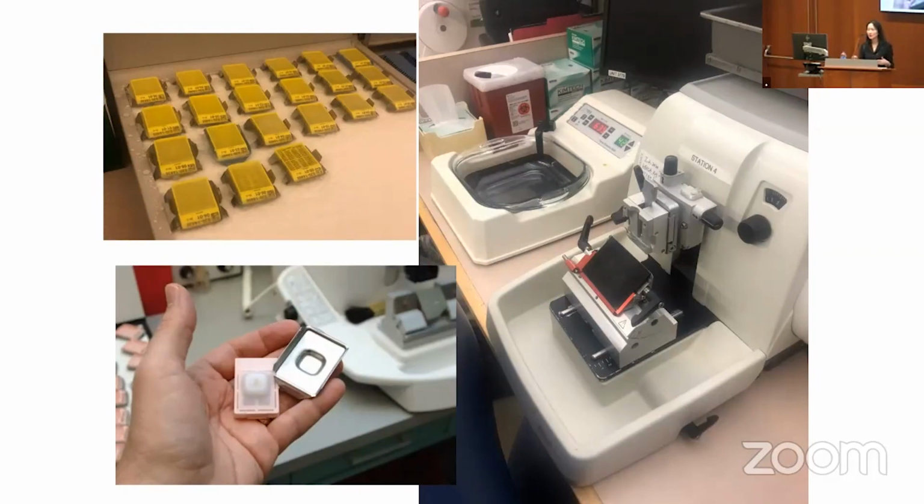The protocol that I have had them do so far at Yale is to do 2 H&Es that are flanking 5 unstained slides, and at the end, an extra slide for my reticulin stain. So all in all, every single bone marrow gets about 8 sections up front, 8 of these slides.